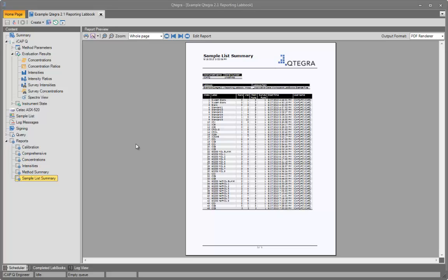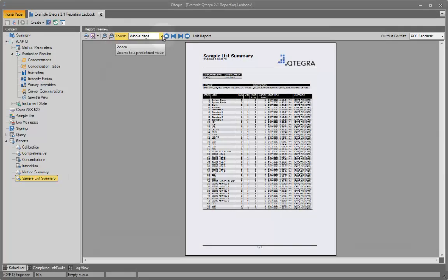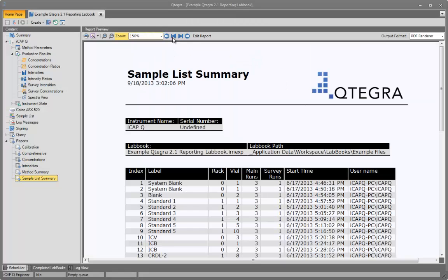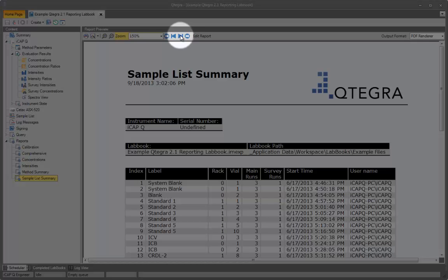From this screen, a series of actions are available. The report display can be zoomed using the magnifying glass tools, or zoomed to a series of predefined levels from the drop-down dialog box here. Next page and previous page controls are here, as well as jump to the start or jump to the end of the report.